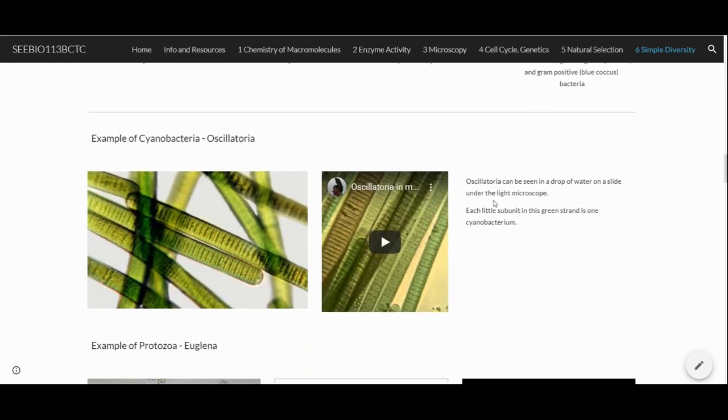Now, Oscillatoria, here's an example. There's a picture of Oscillatoria. When we see those in the lab, they're usually like a big clump, and people grab that big clump and just go for the darkest possible color. But the reality is you focus on the darkest color, but then you go off to the side to try to see the detail.